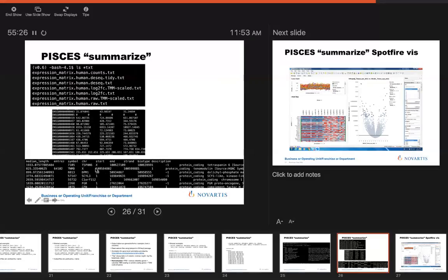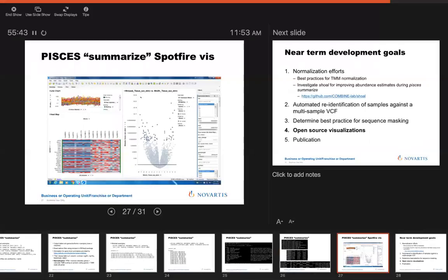This is where I'm using the notables package to pull in things like gene symbol, and this is actually very important for my normalization procedure, which is the biotype. So protein coding is typically all that I'm comparing against.